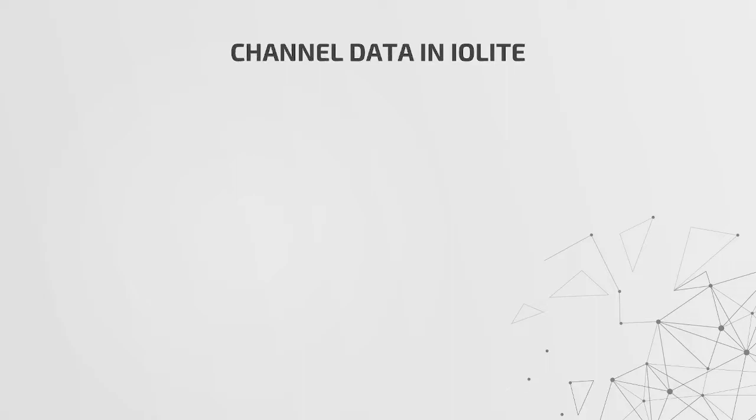Now let's have a look at channel data in Iolite, because after all, this is what we're trying to do. We're trying to create channels that then can be fed into data reduction schemes, or they can be plotted up using Iolite's visualization tools, those sorts of things. We can create selections on them, that sort of thing. This is the main thing that we'll be doing in Iolite. So let's have a look in a little bit more detail at channel objects in Iolite.